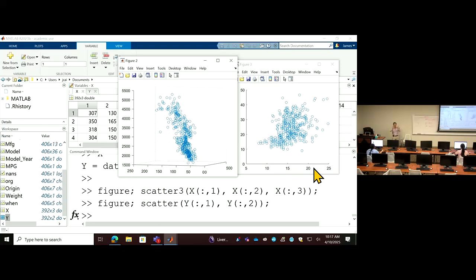You know exactly they are matched by the rows because you sampled the same cells twice, but just use different ways to describe the cell. So this is a small toy example we are using.